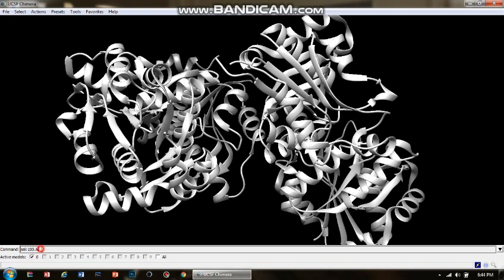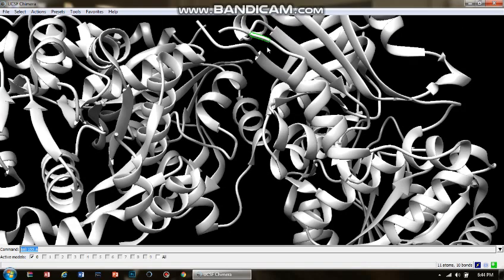Now let's say I want to select amino acid number 100 in chain A. The command for that is: select colon, then the amino acid number you want to select, then dot, then the chain ID or chain name. You enter the command and see this green color that appears — it means the amino acid residue has been selected at position 100 in chain A, and the residue is arginine.